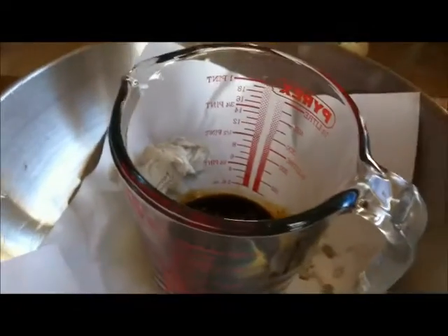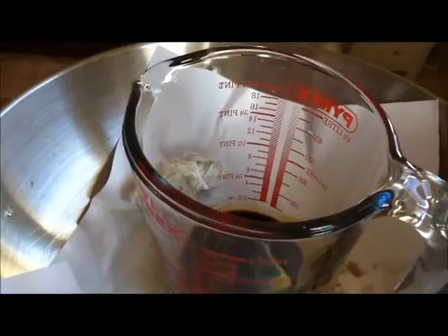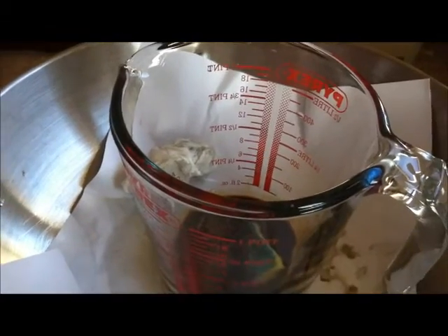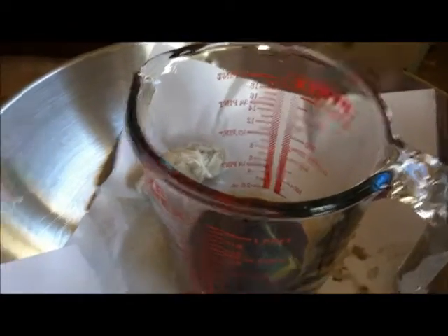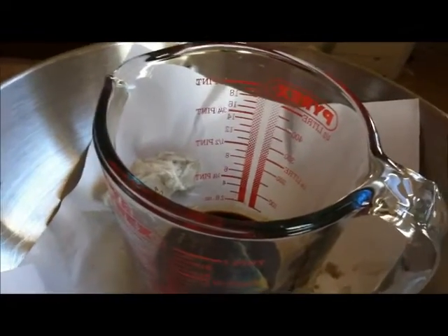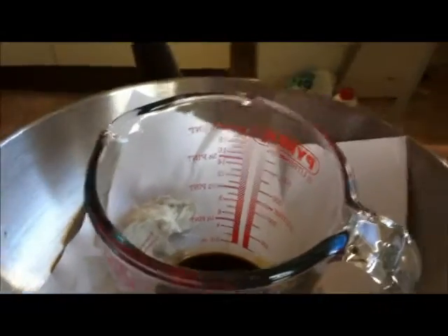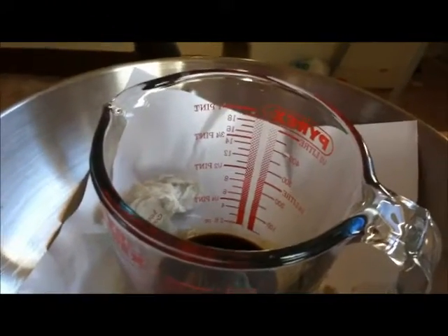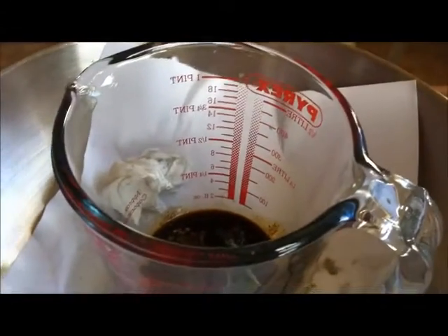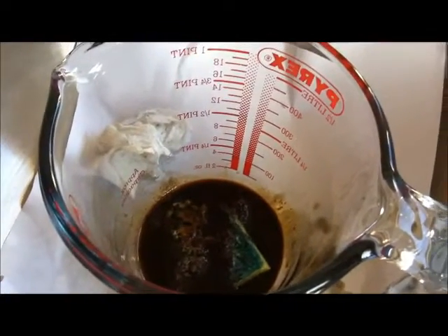I hope you found this video useful. If you're an amateur chemist messing about with this kind of stuff, make sure that you use your protective equipment. Gloves are a must and goggles are absolutely essential when you're using sulfuric acid. Likewise, if you're using any acid - hydrochloric acid or any acid - it's always good practice to use gloves and eye protection. But particularly with sulfuric acid, if you get it on your skin or in your eyes, it's a bad day. Be careful when washing out glassware that's contained this stuff, as it could boil and spit at you.